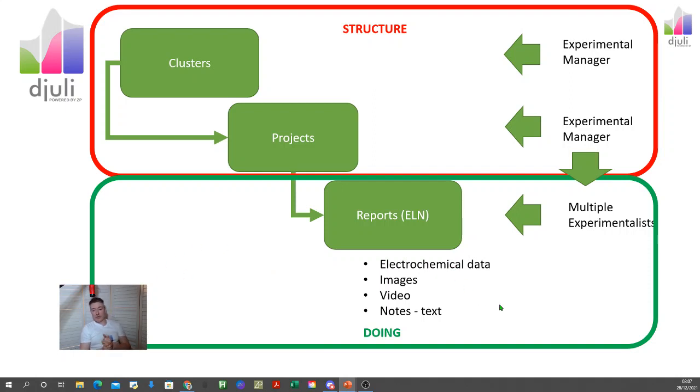So now, first of all, you know where your data is, because it's your account. You're the one who created the clusters and the projects, so you know where the data is. And then you've invited these experimentalists, and they're putting their experiments into your projects.